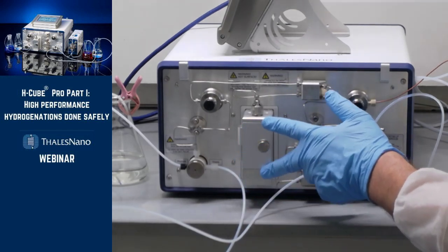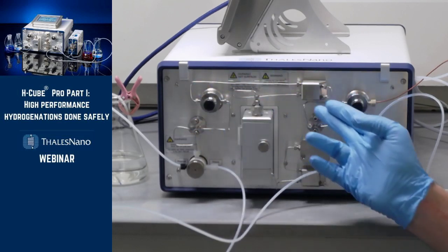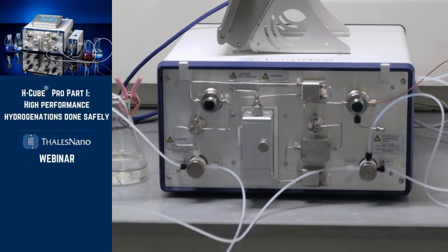The cartridges are pretty safe. They are in a sealed part. All stainless steel tubes can resist much higher pressure than the operating pressure of the system. So it is, I would say, more or less inherently safe. Obviously, you're always working with chemicals, so you have to keep that in mind. There is only a little amount of hydrogen in the system at a certain time. As I said, the system can generate 60 milliliters of hydrogen per minute. This is a fairly small amount, and the chance of an explosion, I would say, is negligible.